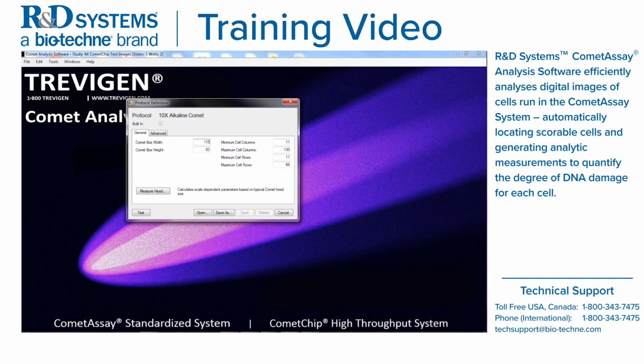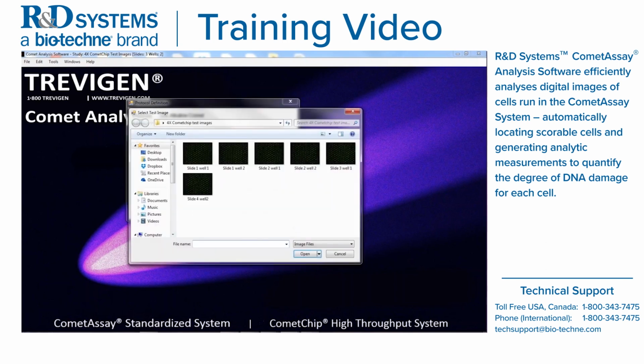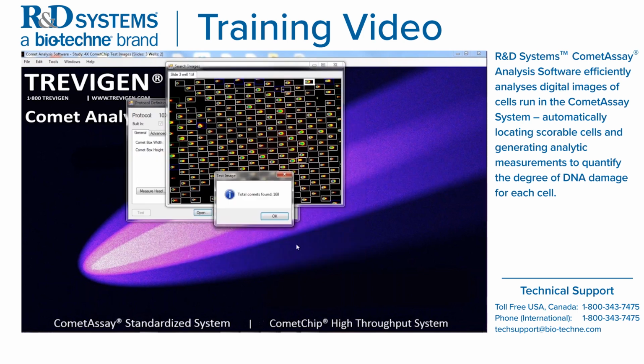So I think I'm decreasing it by 20%. Let's also decrease the box height, go from 83 to 66. All right, now let's test. And again, let's select an image. So again, let's test with the damage. All right, so click Open, and there you go.